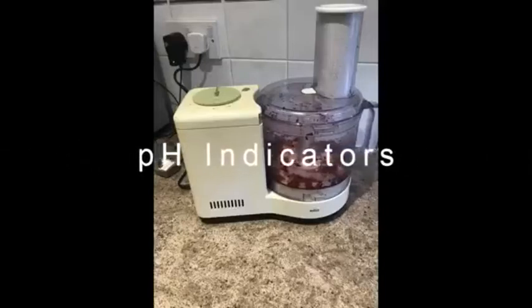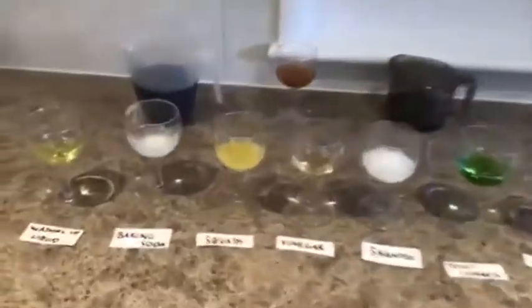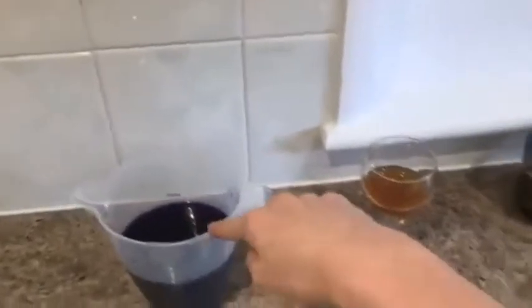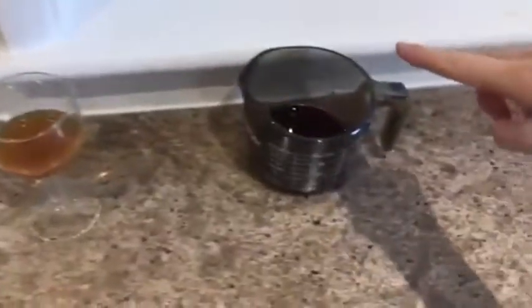pH indicators. This is an image of the red cabbage juice and beetroot juice. These are the indicators I used: red cabbage, curry powder which has turmeric in it, and beetroot juice.